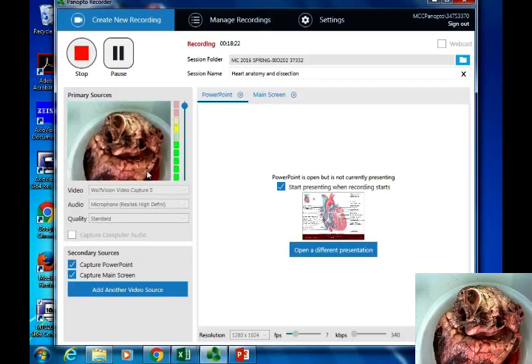All right. So that is getting you set up in terms of what you're expecting to see for the heart dissection. So for you guys, what you want to do is have one person. You don't have to do the dissection yourself, right? If it's exciting to you and you want to do it, then go for it. If you're just going to read the list and tell you what you need to find, that's fine too, right? You work in a complementary fashion as a team. For the lab practical, we're not going to ask you to dissect things, but you do need to be able to visibly identify the different parts listed in the table in the lab manual.